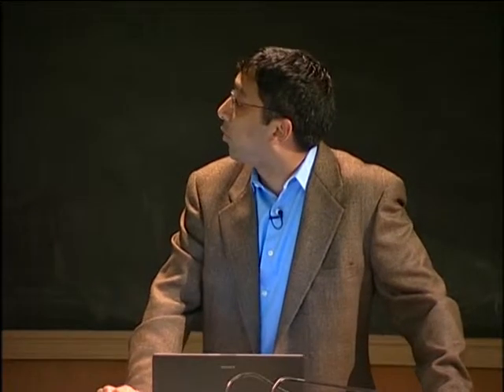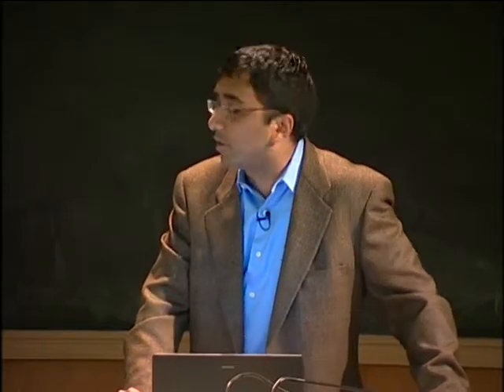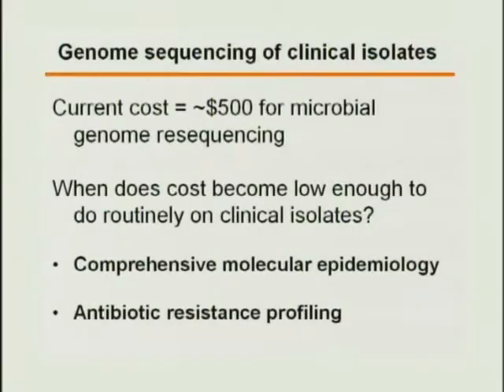And why bother? Essentially, this would enable comprehensive molecular epidemiology. So even if it wasn't relevant for a specific patient, you would have a sense of what was going on across the hospital or the community. And potentially, as we learn more about the determinants of antibiotic resistance, this would be a way of doing that as well, right?